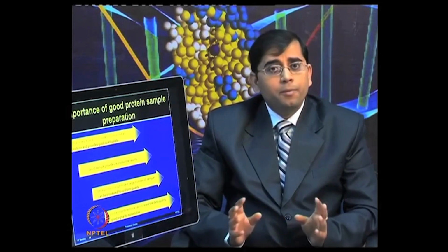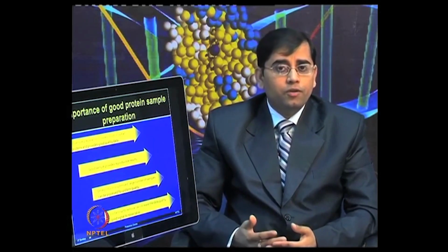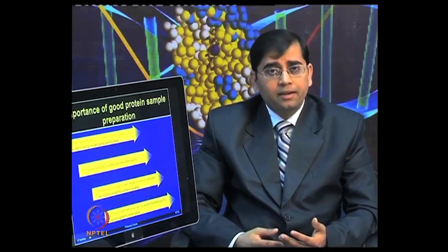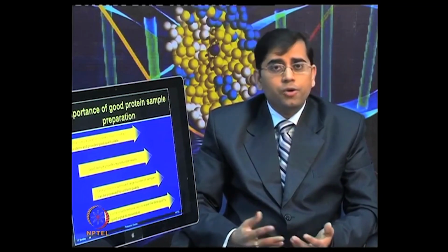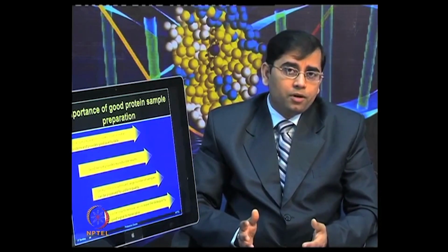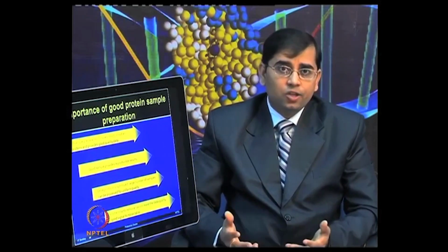Once you have optimized a protein extraction protocol, then you can apply the same protocol for large studies. For example, if you are performing a clinical trial study on 200 patients. So, once you have optimized the protocol with a small population, then the same protocol can be applied for a large number of samples. So, that is going to ensure the success of the clinical studies.